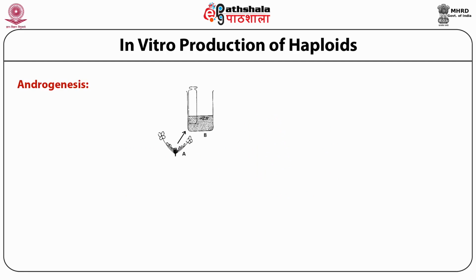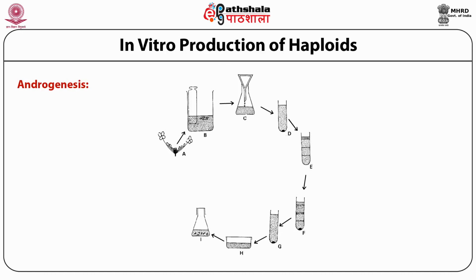The technique of isolated microspore culture is very simple. You take the flower buds, isolate the anthers, put them in a liquid medium, and crush them with a pestle. Once this is crushed, the pollen grains come out and float into the medium, which is then filtered. The filtrate carries the microspores, and the filter paper retains the rubbish on top. The filtrate is then centrifuged in a tube, and the fine rubbish and the microspores settle down, which are then purified by gradient centrifugation. The purified portion is collected, suspended in a liquid medium, and plated. So these microspores are generally cultured in liquid medium.